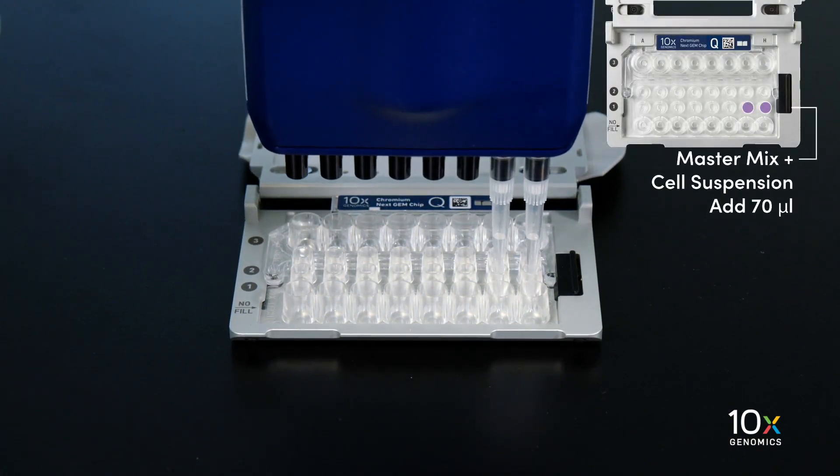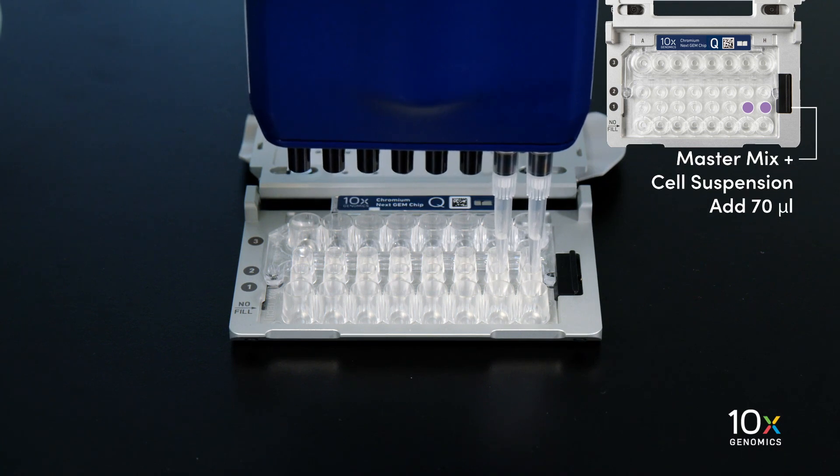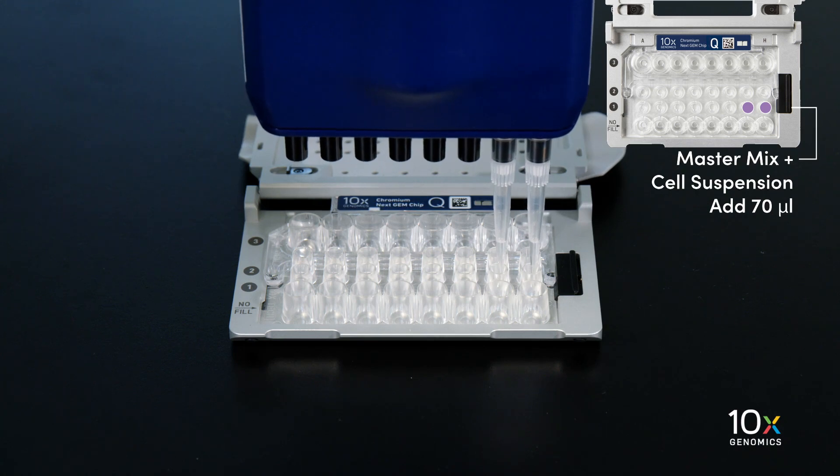When loading the chip, raising and depressing the pipette plunger should each take approximately five seconds. When dispensing, raise the pipette tips at the same rate as the liquid is rising, keeping the tips slightly submerged.